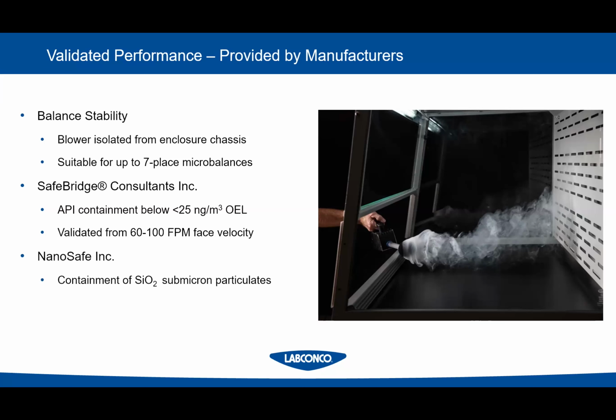Things to think about when you're weighing powders. We have these enclosures that have ULPA filters in them for basically the nano world. We've had them for a long time. They do a little bit different kind of particulate containment. I lose my voice talking this loud.